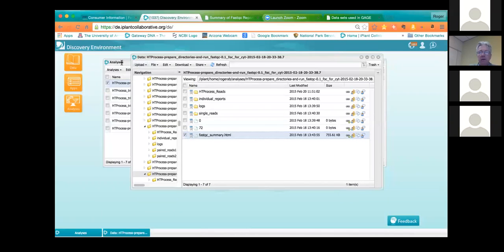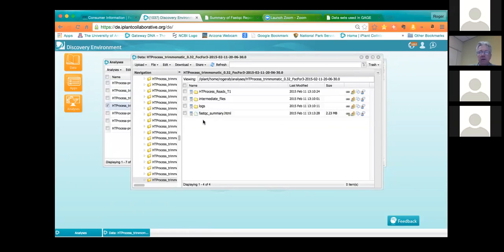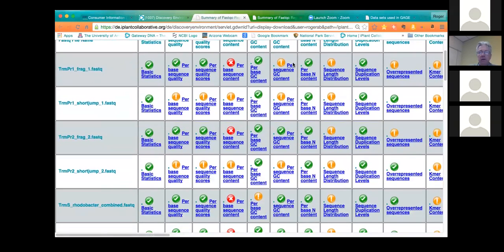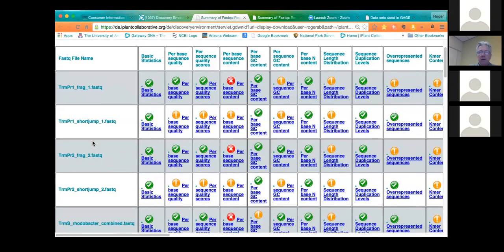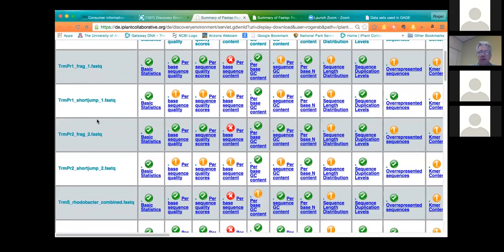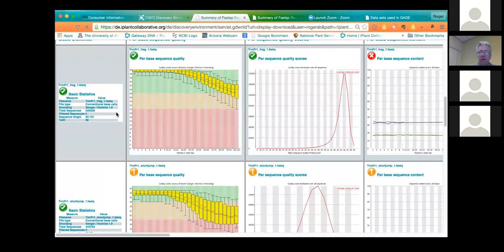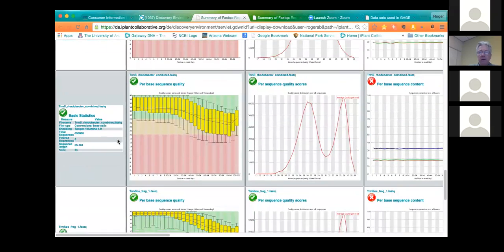is that when you're looking at the results for Trim-O-Matic, it also has a FastQC Summary file. And this is a different one because after trimming, this application reruns the FastQC set so as to give you immediate feedback as to how well you did in trimming. And this is the same set of data, the FRAG1, FRAG2, but in this case, I included FRAG1 and short jump 1 and short jump 2 all together in this library, even though they didn't share all the same properties, like pairing distance. But I did this to show you that if all you're going to use it for is for running these two steps, then you don't necessarily have to separate the data.